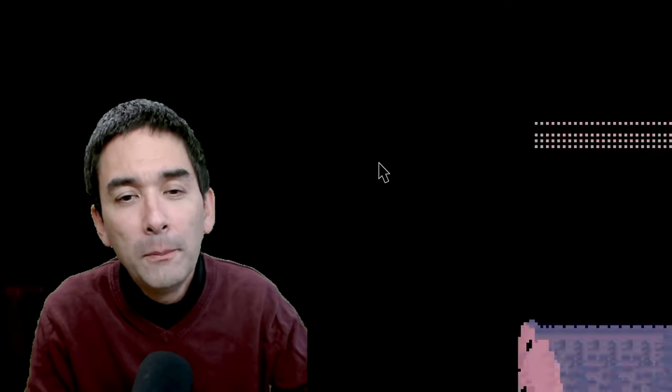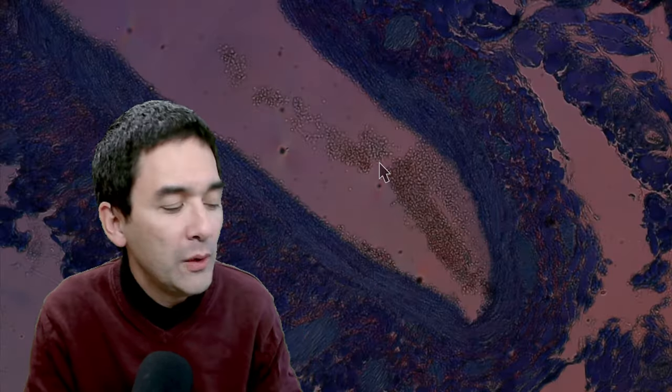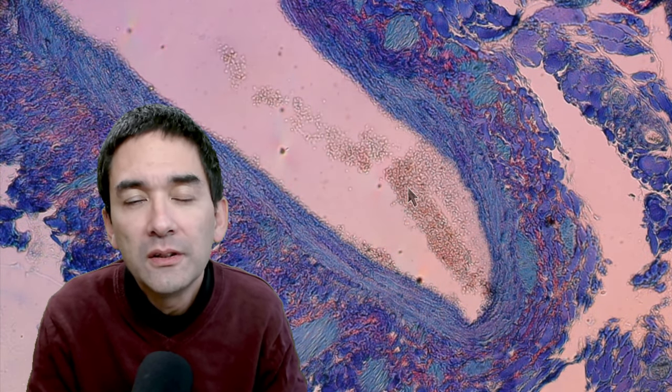I'd like to go up with the magnification now to show you how this actually looks. Now you can see the red blood cells a little better. You see, they're kind of dotted. These are the individual cells. And the wall here is fairly thin compared to an artery.